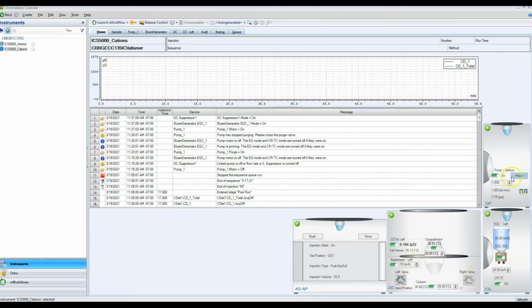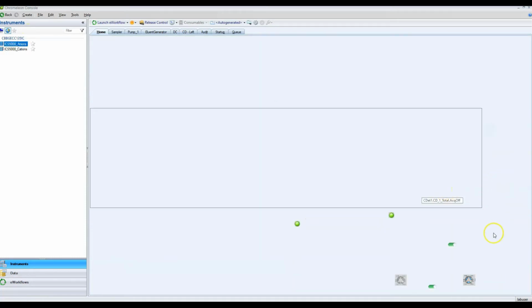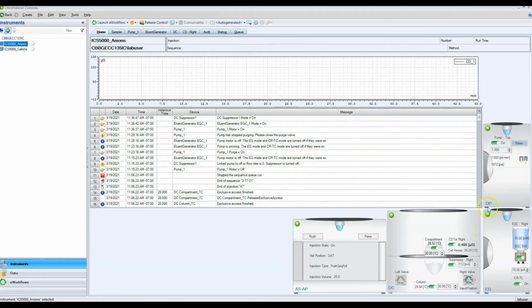Now, they won't always be right at these values. Normally, they will be in idle mode. So this will be at like 0.1, this will be at 5, and this will be at 5 as well. And that's when the machine is just running in basically slow motion. Right now, they happen to be at the correct values because someone else was actually running the instrument before I decided to record this video.